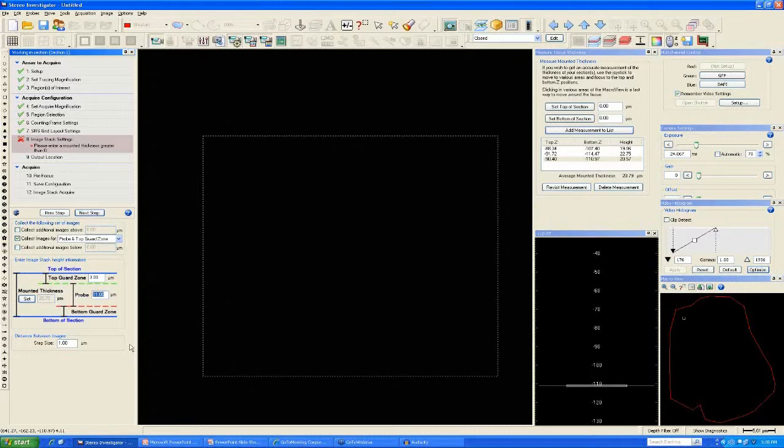The final option in step 8 is to enter a value for the distance between images. Depending on your hardware, the minimum value that you will enter here will vary. We recommend looking at your hardware specifications as well as the memory capabilities of your computer before making the decision of a step size. Other important considerations are the sizes of the objects that you wish to observe and count stereologically. We will proceed with a measurement of 1 micron step size.